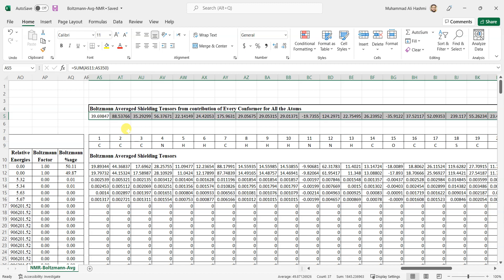You can simply copy these shielding tensors and then reference them as I told you already how to reference with different solvents. If you want to reference them with methanol, ethanol, or whatever you want, you can use these shielding tensors because these are the Boltzmann averaged ones now.